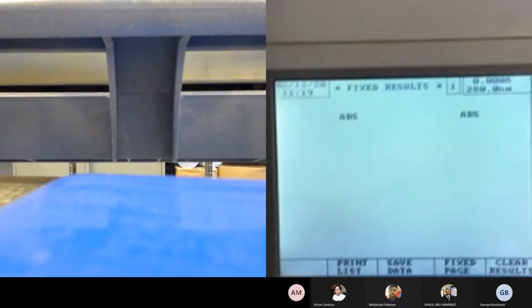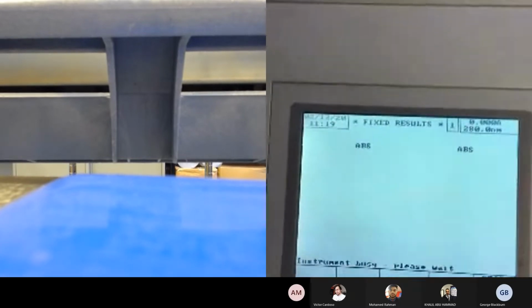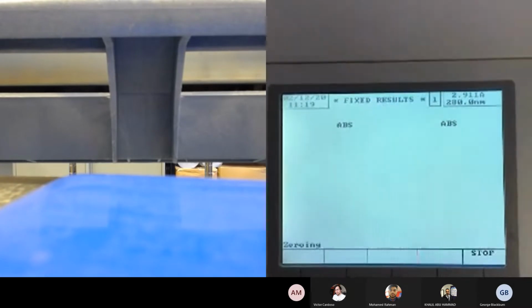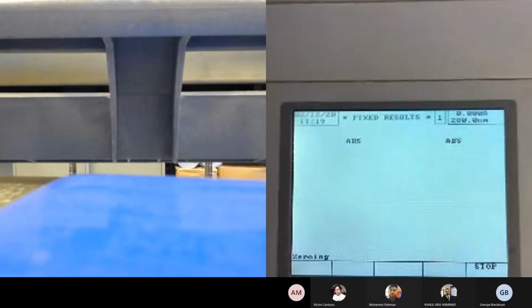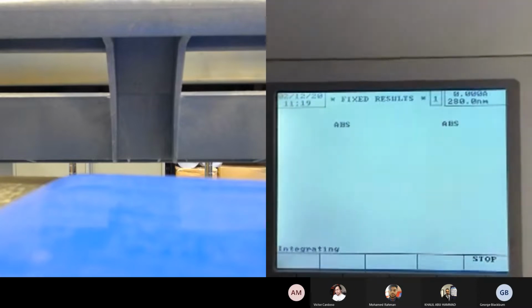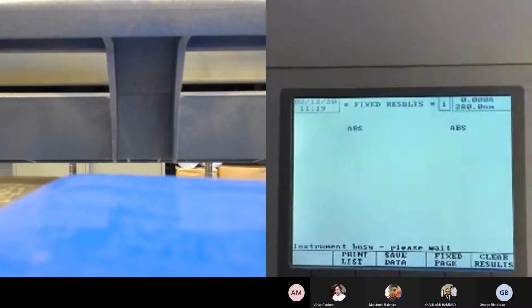So if I just press run, it will measure the absorbance. The first one it will measure is cell 1, which is just a blank, so this should come out as 0. If it doesn't come out as 0, then I know there's a slight issue, and I'll have to fix something. So this is a blank just containing the, what is it, phosphate chloride buffer?